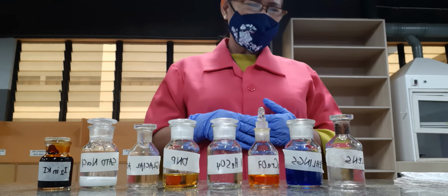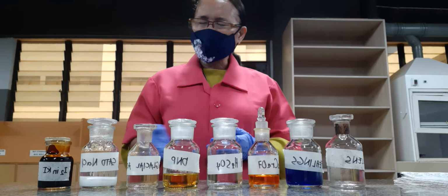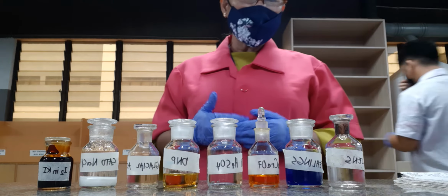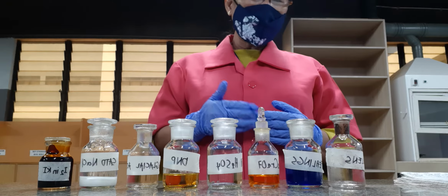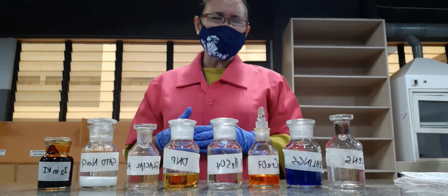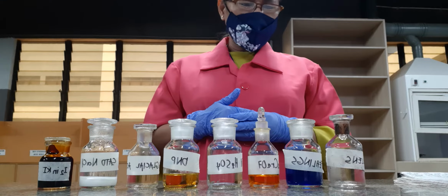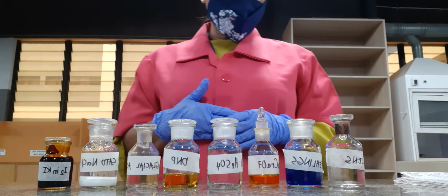the miscibility test. The chemical reactions that take place with aldehydes and ketones will determine the different reactions involved when these aldehydes and ketones undergo reactions with different substances. First, we have what we call oxidation reactions. In oxidation reactions, we involve different types of oxidizing agents. To begin with, we shall be conducting tests according to an oxidizing agent.